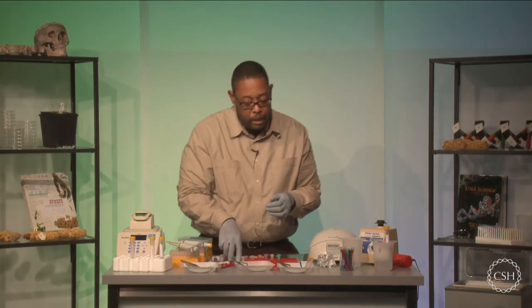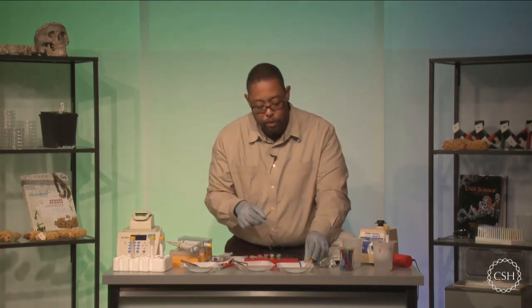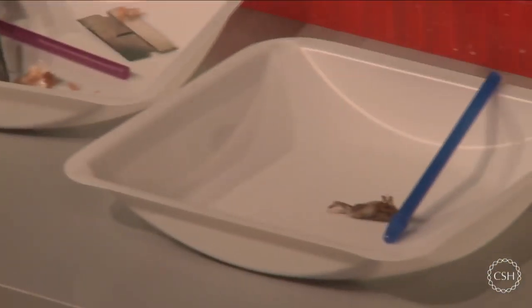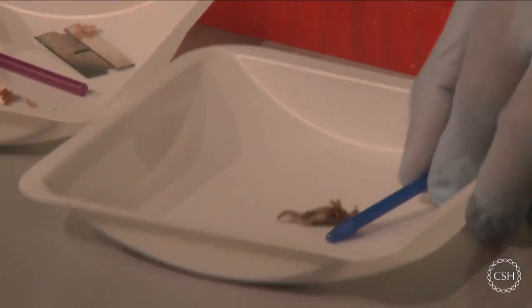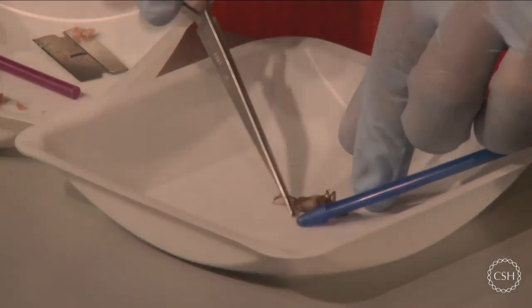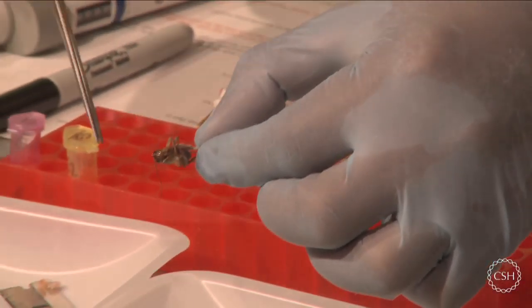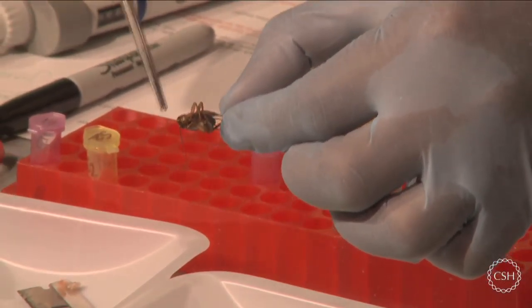All right. Now the last sample that I'm going to work with here is my insect. And this is actually a house cricket. This is something you can find around the yard. And all I really want from the house cricket is a leg. Okay? And you're going to see that the cricket pretty much has enough material for you to work with. Do not take from the body, because this actually will add problems or contaminants to the reaction.